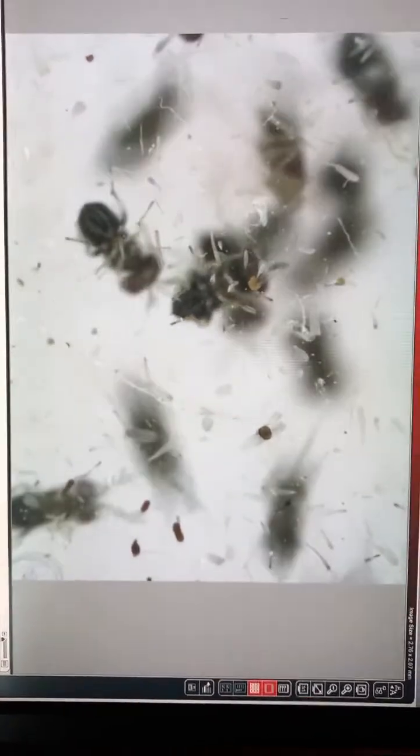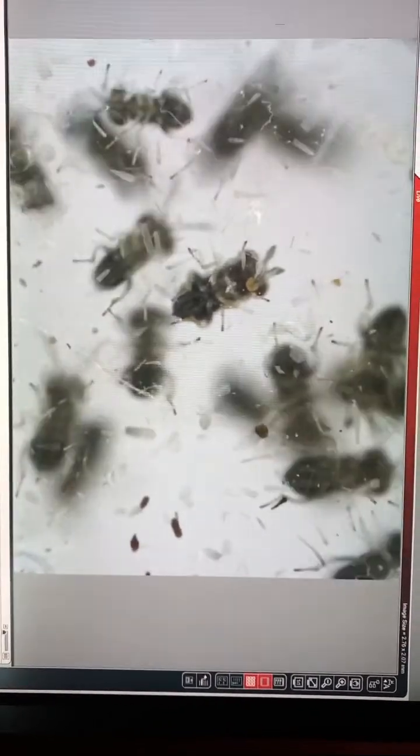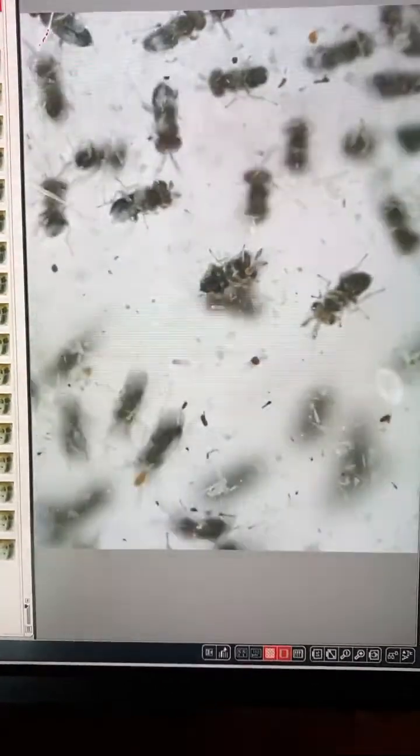There is this little bit dirty glass because of scales of moths, and under high magnification difficult to stop some specimens because they are crowding very fast. I can make a little bit better focus, but all insects crowding very fast. But you can recognize that this is central. In center, this is a female with rounded short antennae. And under the microscope visible also ovipositor, female genitalia. So it's better to decrease magnification to see larger screen with more individuals.